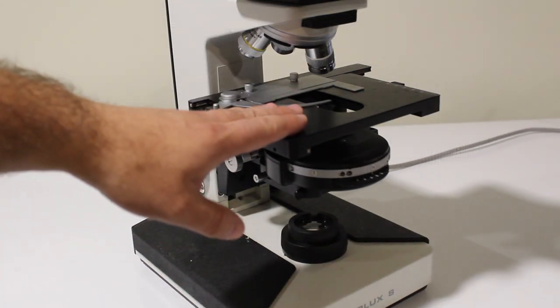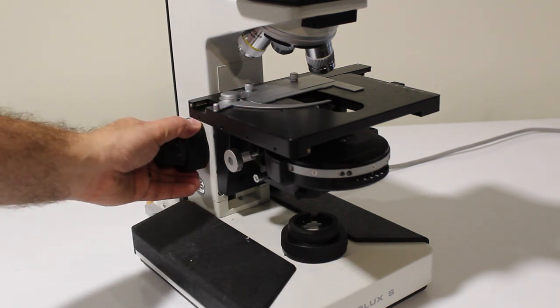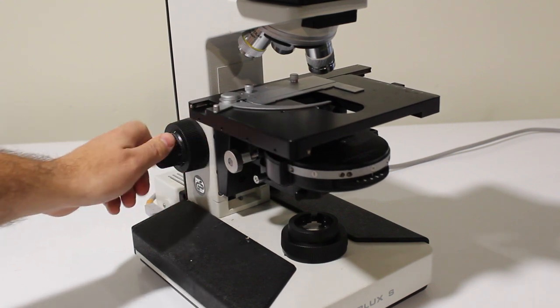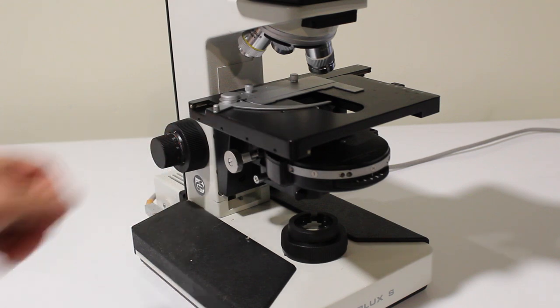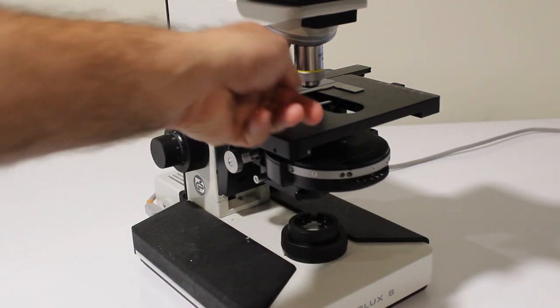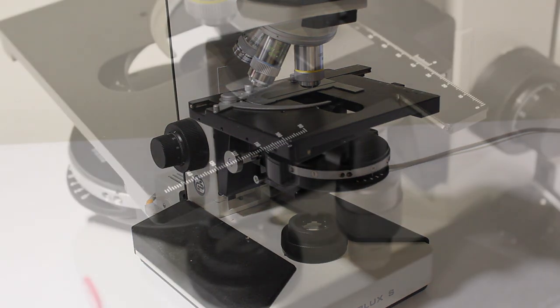Above the condenser is a stage where you place the slide containing your sample. You focus on that sample using the focus knobs here on the side. There's typically a coarse knob, which is on the outside, that moves the stage quickly, and then a finer focus knob, which allows you to more carefully tune your focus. Now, most microscopes move the stage, but some will instead move the nose piece where the lenses are located. In either case, it works in the same fashion, and it's just slight differences in design.